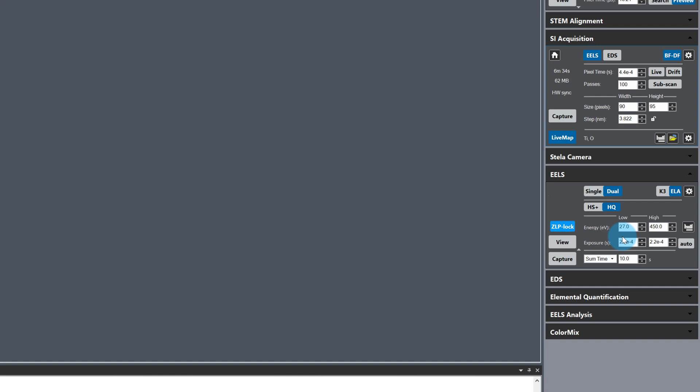I've also enabled ZLP lock for live energy drift correction as I'm going to be collecting spectrum images in multiple pass mode.